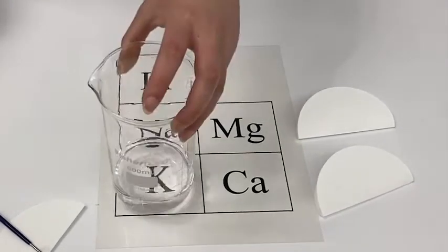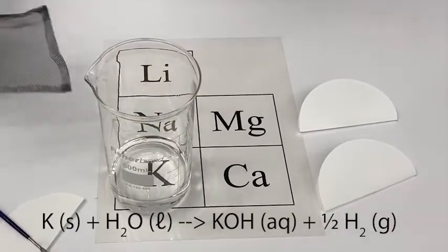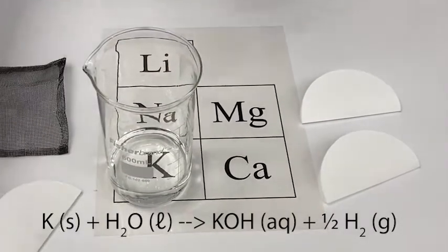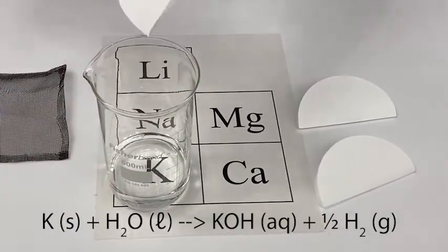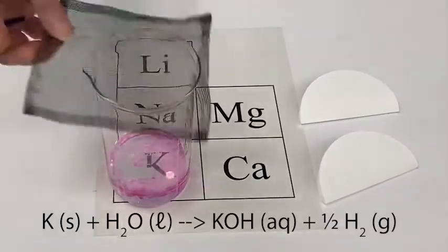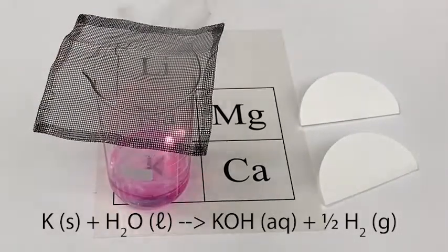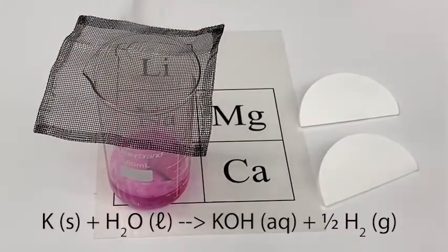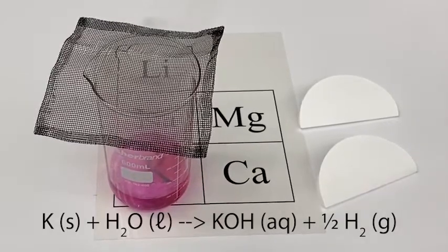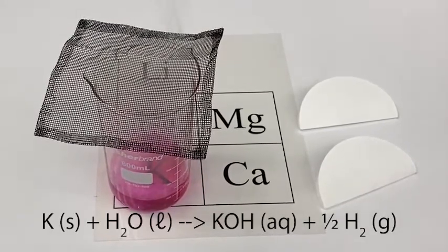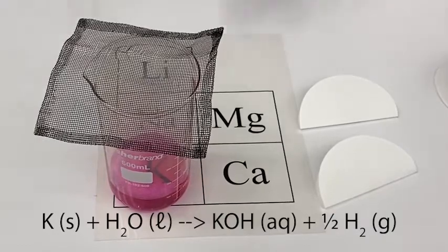Now let's take a look at potassium. Potassium is in a big beaker, and I have a screen for the top of it. Just like the other reactions, this one also produces hydrogen gas, but the reaction is so vigorous it lights the hydrogen gas on fire. The purple color you see is from the potassium ions.